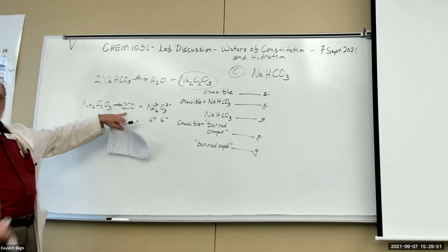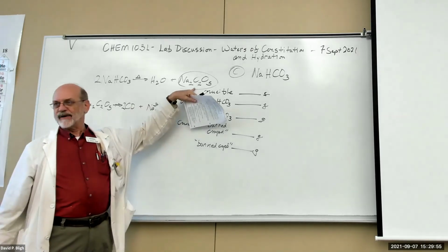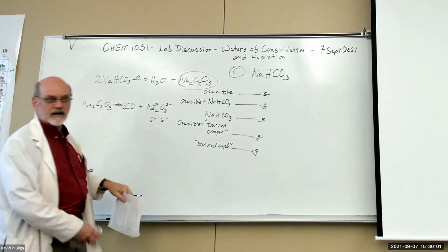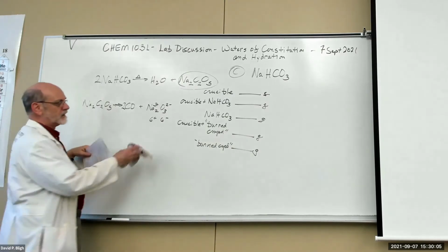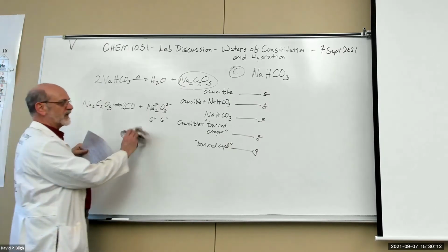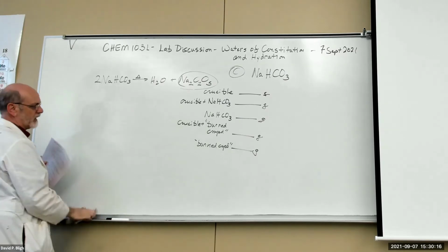Why are we even bothering with this? Because this is not a real compound, right? If we looked at the balance of charges in here, it doesn't exist. So there has to be something else come out of it. And sodium's not going to come out because we're not hot enough. Sodium's going to be left behind in some form, so it has to be a carbon-based compound.